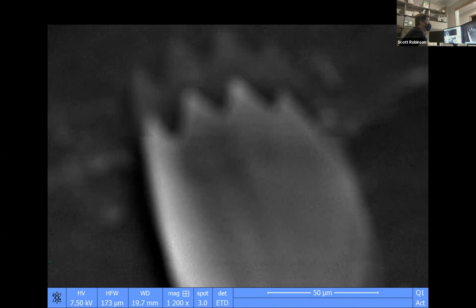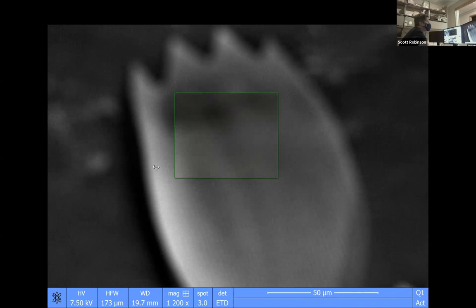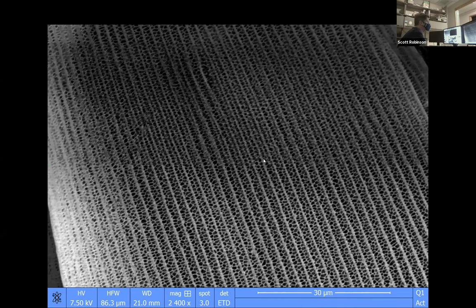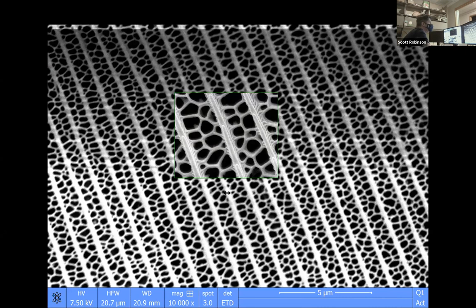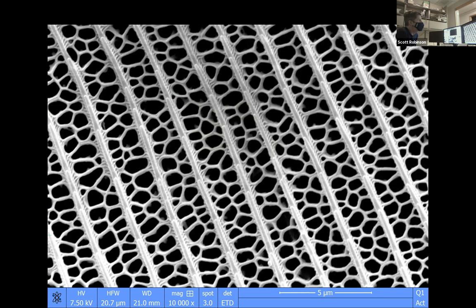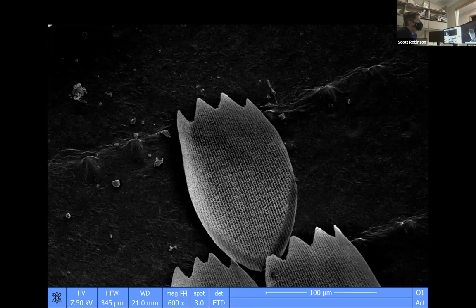And so now we have something that looks really out of focus. It's a wing scale from a butterfly. And if we focus on that wing scale, we can see these little ribs, and we can see this little substructure to the scale. And if we fix the contrast and brightness a little bit, it's really beautiful. Whenever you rub the wing of a butterfly or a moth and you see that little powdery stuff that's coming off, you're looking at an individual one of these little flake-like things. So these are like little ruffled potato chips.